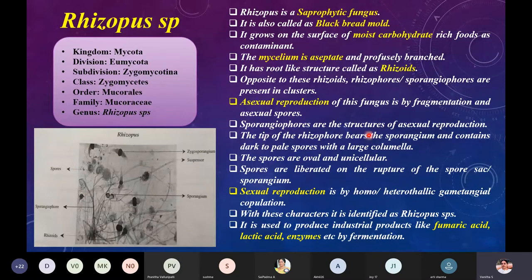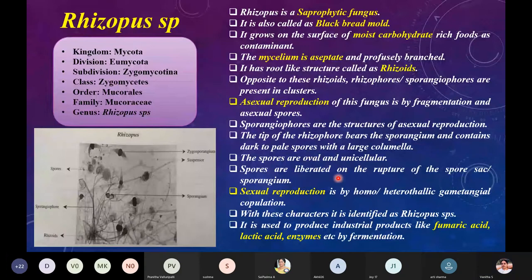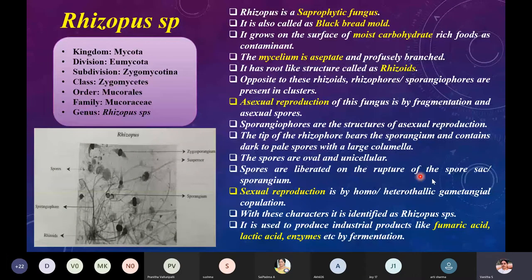The tip of the sporangiophore bears the sporangium and contains dark to pale spores with a large columella. Spores are oval and unicellular. Sexual reproduction is by homothallic or heterothallic gametangial copulation. Rhizopus is used to produce industrial products like fumaric acid, lactic acid, and a few enzymes mainly by fermentation.